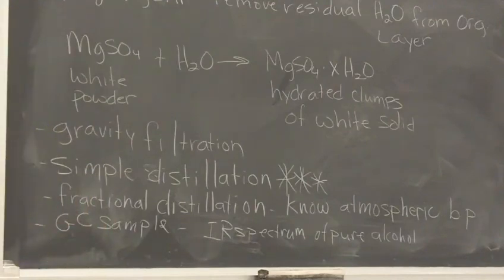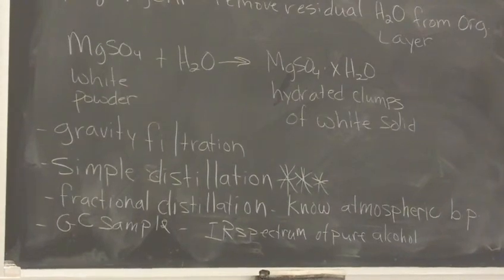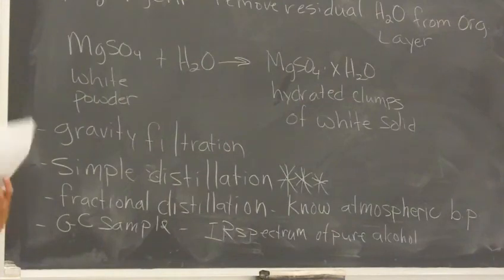But make sure you collect that before you go on to experiment 11. So keep that in mind for next week. You need your IR spectrum, GC sample prepared. We'll prepare those in lab next week before you go on to experiment 11, okay? All right, any questions you guys have?